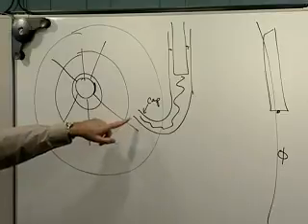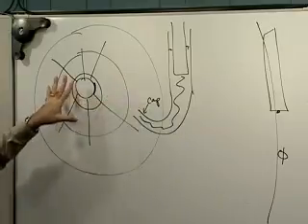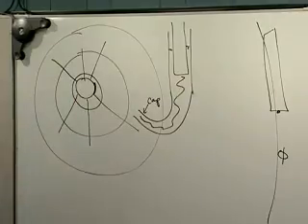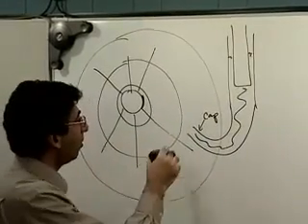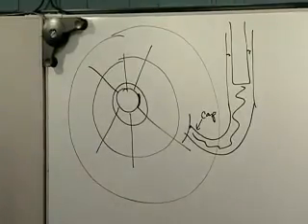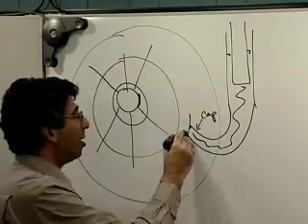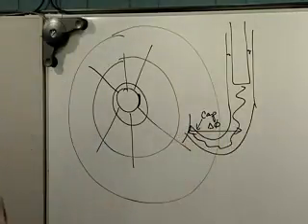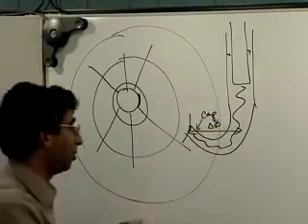Okay. First of all, just physically, this lets you get your reference electrode close to your working electrode. You've got a sort of a J-shaped device here, so you can get it close to your electrode. But it turns out, if you pick standard capillary dimensions over there, what you essentially do is you capture the potential surface that's right at the mouth of the Luggin capillary, and you transmit it through the capillary. So you're not changing potential. There's no potential drop here if you do it this way. And so if you're very concerned about the potential of your working electrode, then this is the way to do it with a Luggin capillary.